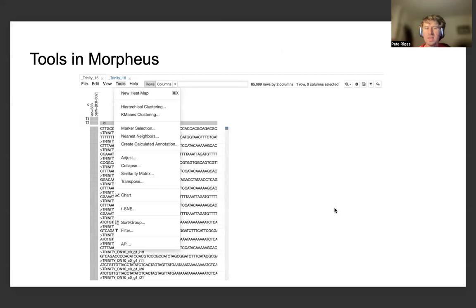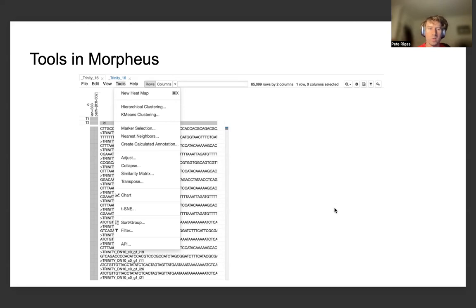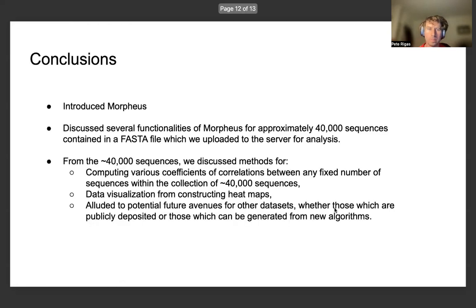Besides the coefficients and other types of clustering methods — such as hierarchical clustering or k-means clustering — there can also be other types of charts, similarity matrices, and sorting and transposing sequences from this FASTA file, which we can do in Morpheus as well.